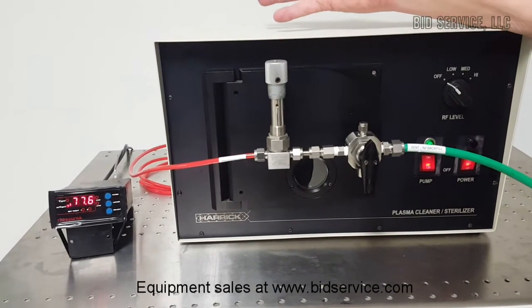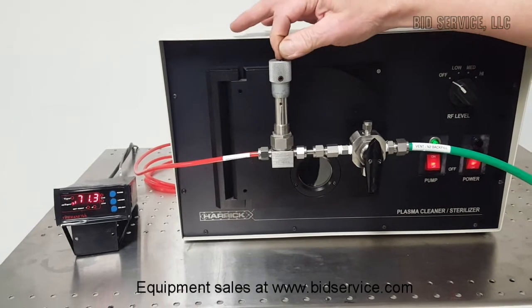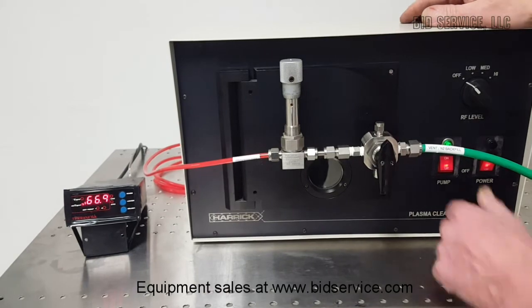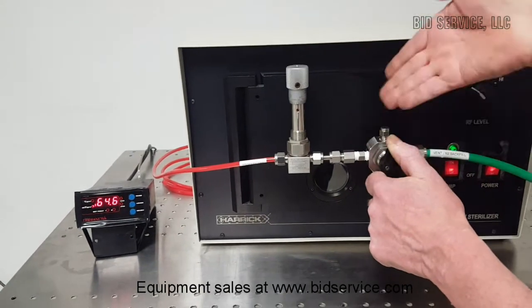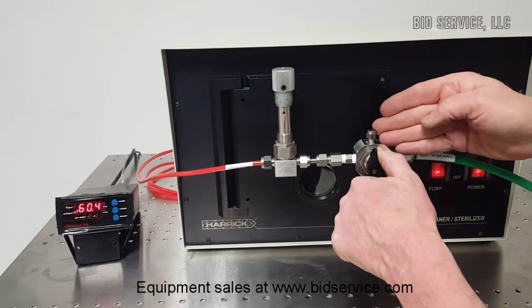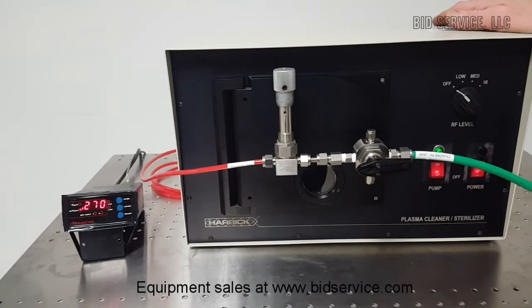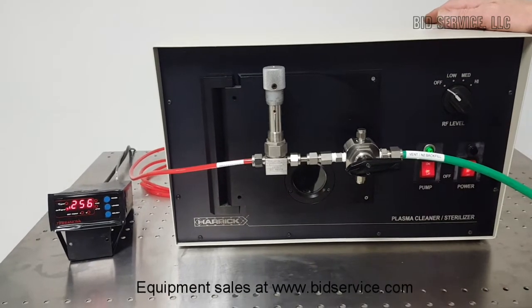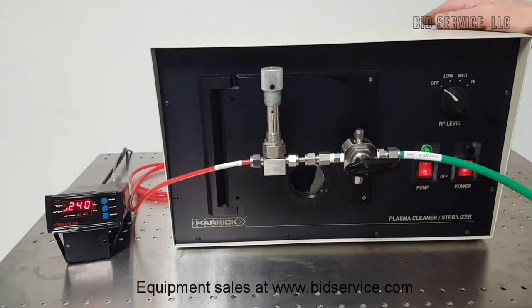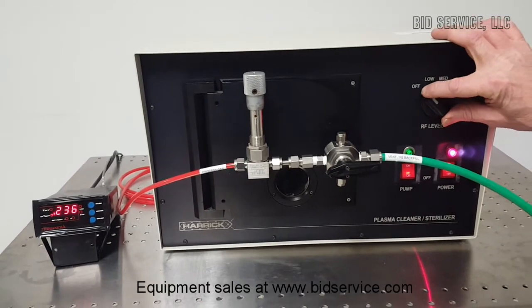Once you are setting up your process, you will need to do some experimentation regarding your metering valve. I have got this set for around 300 millitorr. Now that we are down to our base vacuum, we are going to turn our valve to the left on the three-way valve. As you can see, we are now introducing what is essentially a calibrated leak — we are introducing process gas into the chamber. Once that has been done, we can then turn on our RF power supply.